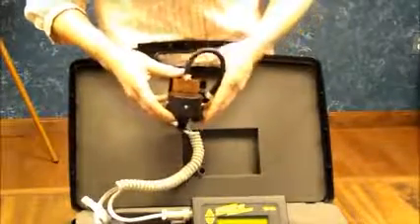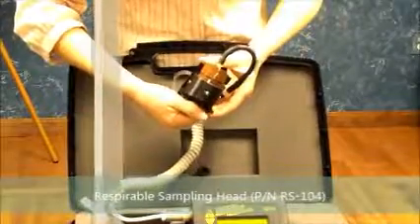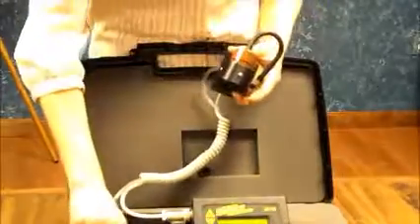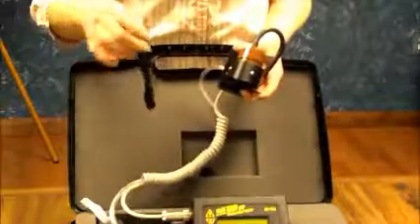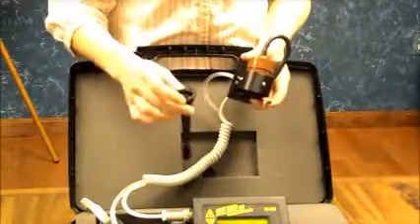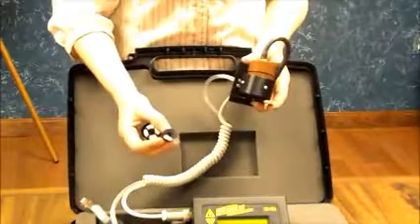The next one I am going to show you is respirables. So we are going to need to remove the thoracic sampling head, the TS-104. We are going to need the RS-104, which is the SKC-GS cyclone. In order to use the SKC-GS cyclone, you are actually going to need the GSA-204 adapter.